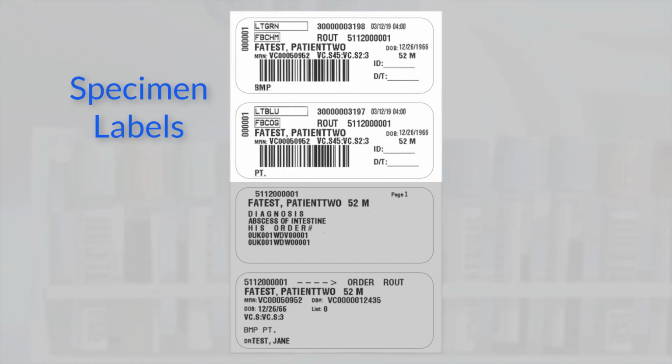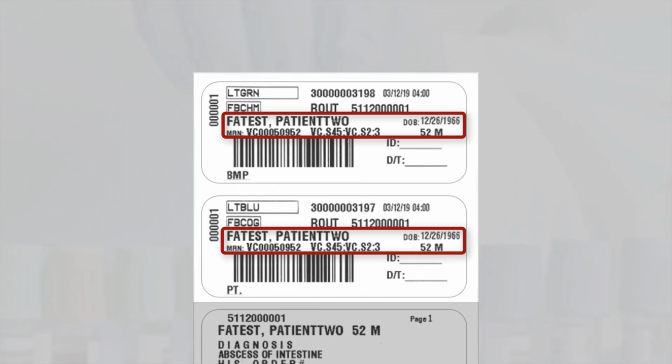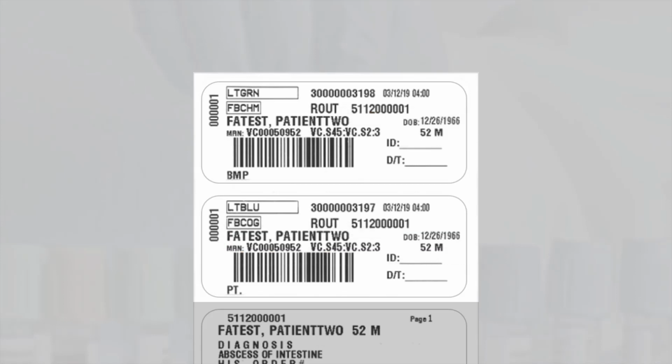These labels, the ones with the barcodes, are the labels that will be used to label the specimens. Let's take a look at the components on these labels. Here you see the patient's demographics, the patient's last name and first name, the patient's age, gender, and date of birth. Under the patient's name is the medical record number, and to the right is where the patient is located in your hospital. Next is the specimen information.